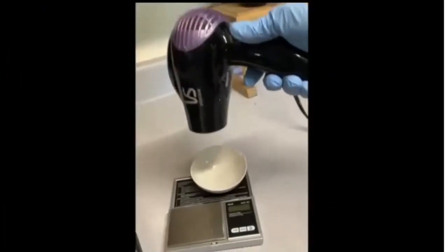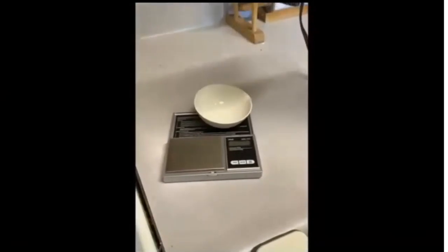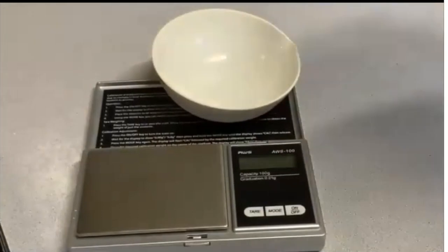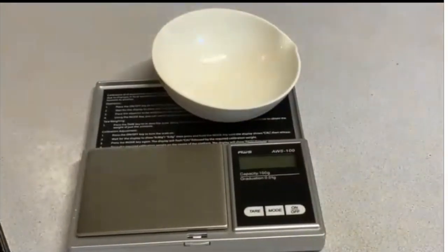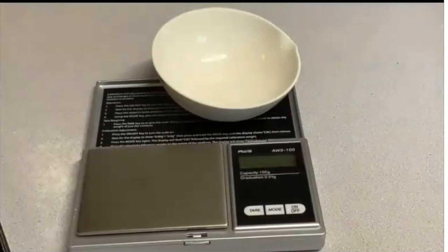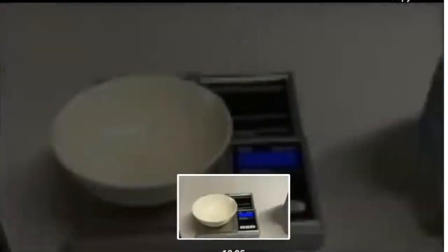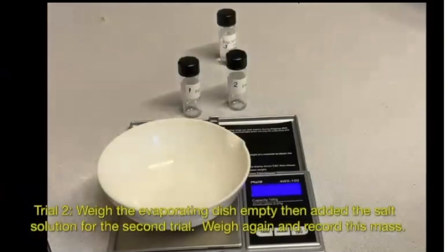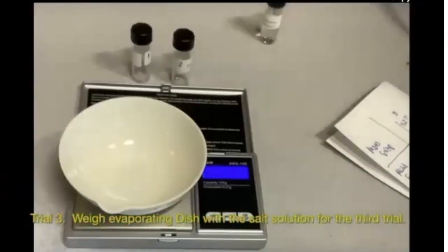And then I use the hair dryer to make sure the thing is dry. If you're going to use the hair dryer to remove any residual water, don't point it directly at the residue because it'll blow it out. You've got to be gentle with it. If you blow it out, then you'll lose some residue and then you make a mistake. So the rest of this video is just showing you trial 2 and trial 3. So I'm showing you all the trials and I'm fast forwarding it here. Okay. And that pretty much is the experiment.